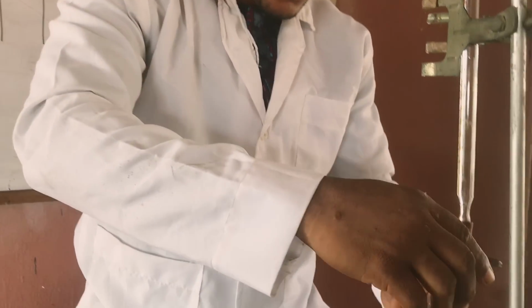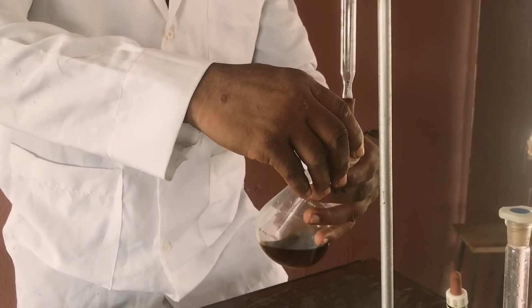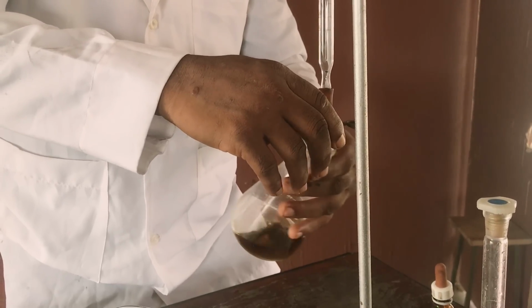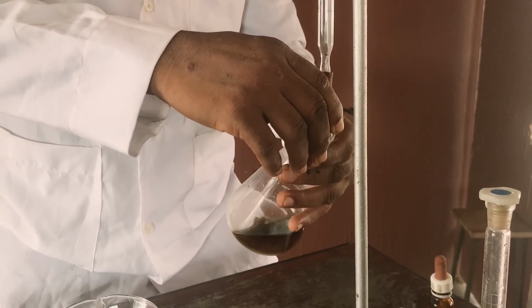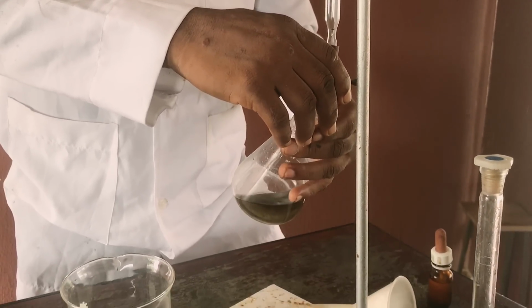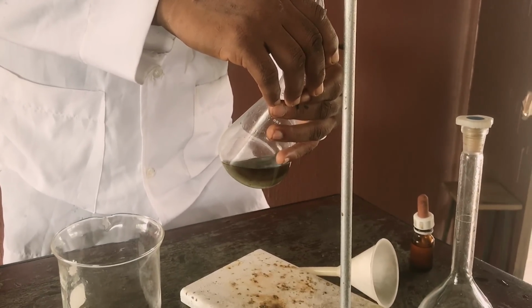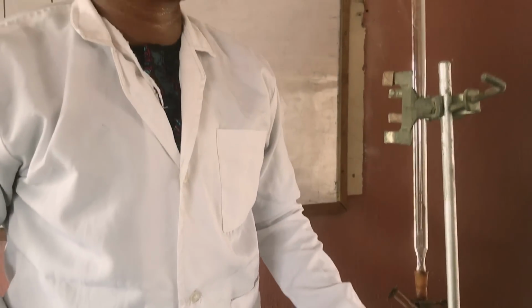So let's see. Now gently, please, when you are titrating this, gently, in drops, gently, in drops, very important. Until you have a colorless solution. Gently, you can see that, colorless. So let's have our readings now.